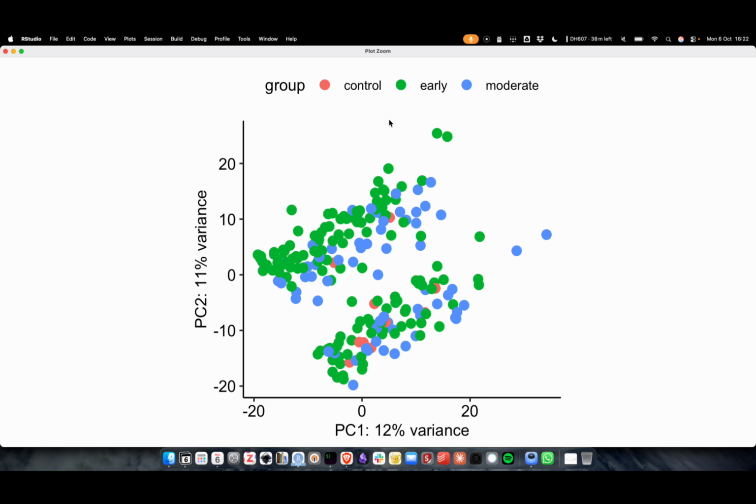We have not covered PCA in the class, but intuitively what PCA tries to do is look for a possible rotation in your data such that the variance of the projected points along that projection is maximized. How many of you have not seen PCA or do not know what PCA is? Okay, fair enough, that's fine. I will cover it, just that some of this overlaps with the other class, so that's why it's been covered there.